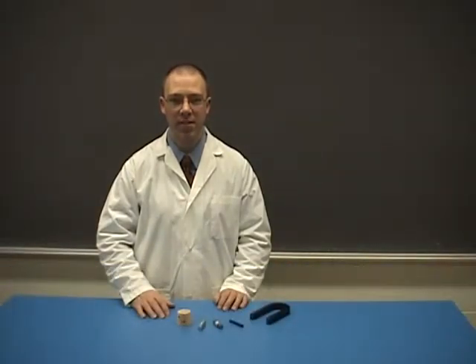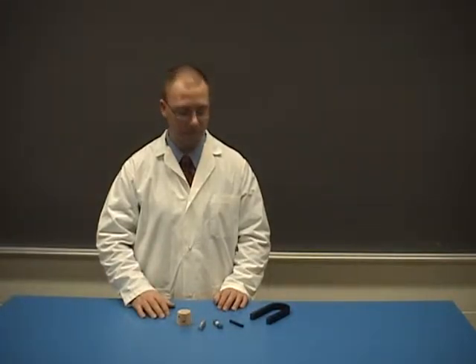Test 2, verification of magnetism. Bring the magnet close to the substance. If the magnet attracts the substance, then it is magnetic.